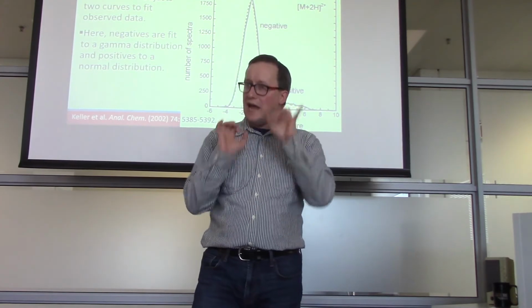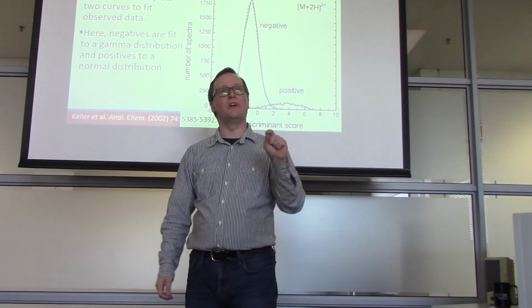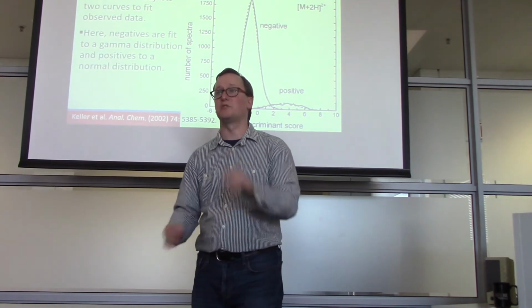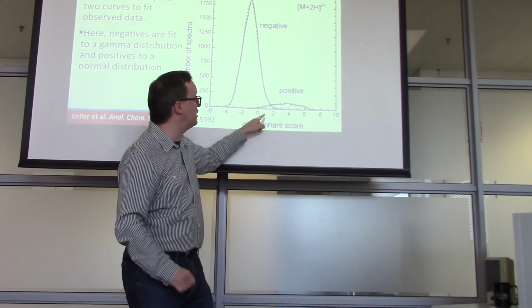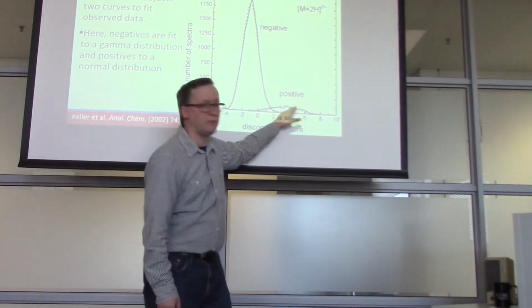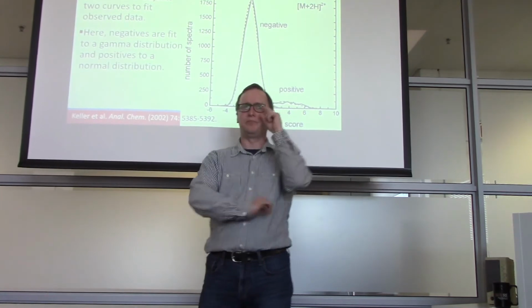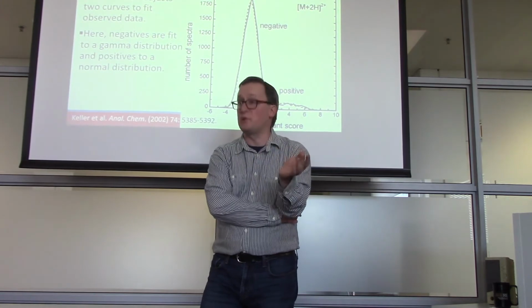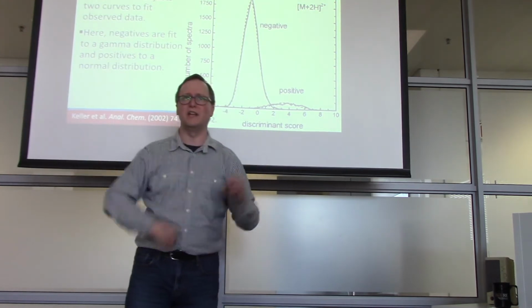And then they said, for every spectrum that matched best to H. flu out of this very large database, we're going to say is a true sequence. Every spectrum that matched to something else, we're going to call a false sequence. And then they looked at the distributions of how their scores compared. And you see that we have these low scores that had this huge peak, and then this very small number of spectra that were for the true species. This represented, by the way, one of these older data sets where fewer than 10% of the spectra were identified. This is off an old LCQ instrument, way back in the ion trap days.